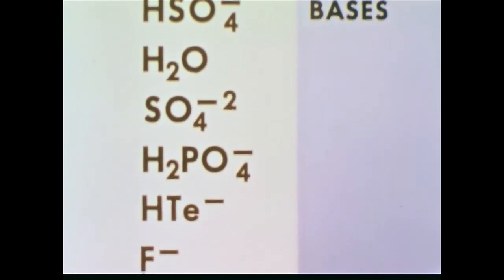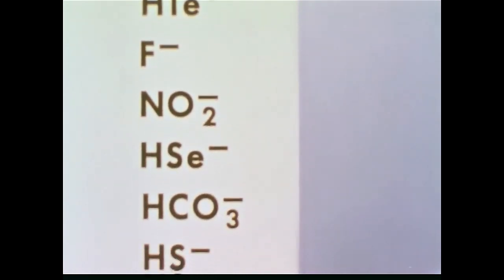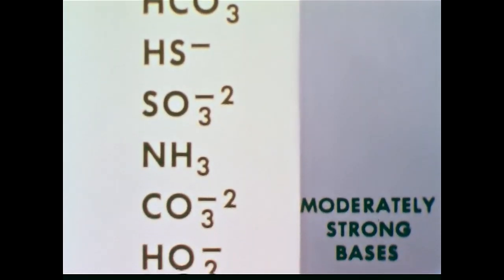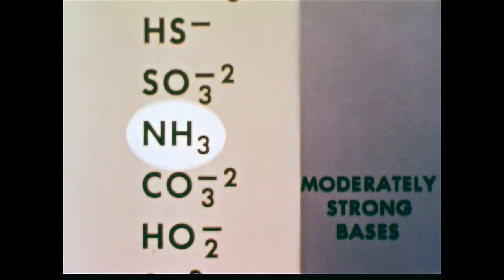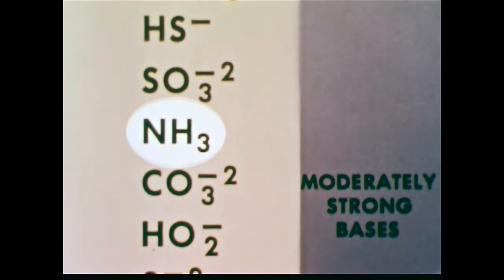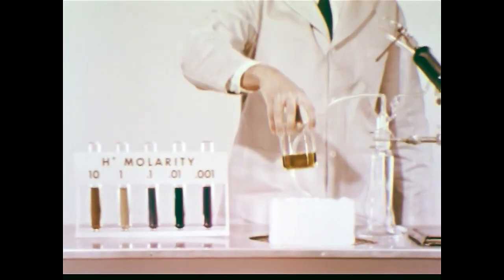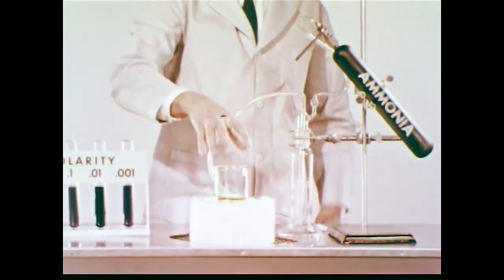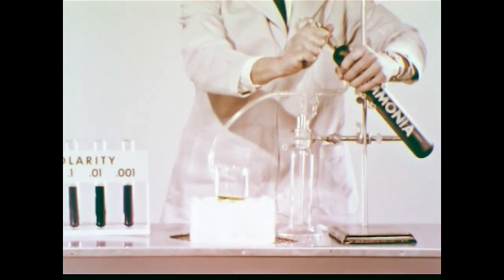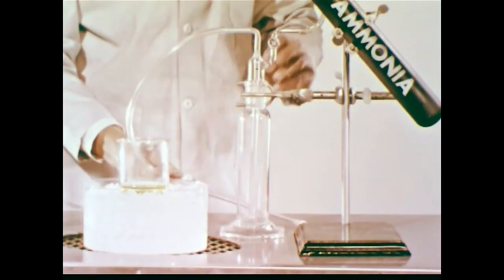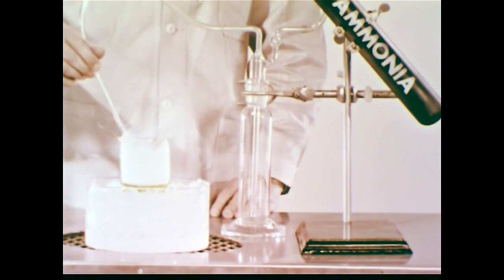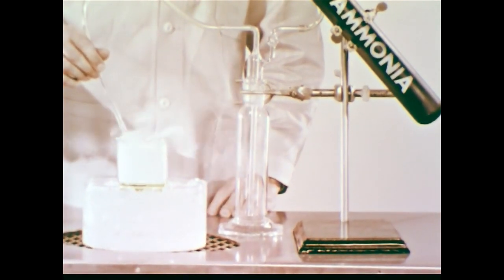Looking down the list for a stronger proton acceptor, preferably a base containing a high percentage of nitrogen, we find NH3 — ammonia. If we add ammonia gas to concentrated nitric acid, the acidity should decrease. The safety trap would catch any backup of nitric acid. The ice bath absorbs most of the heat of the reaction. A glass tube with a porous tip is used to introduce tiny bubbles of ammonia gas into the nitric acid.